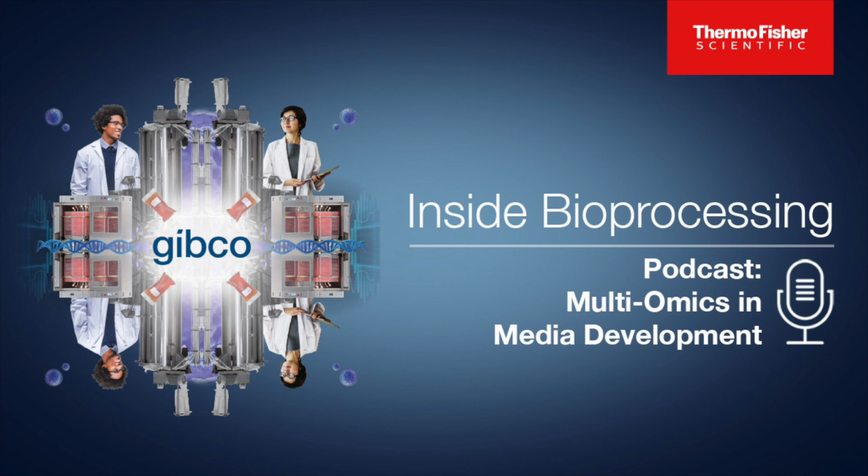What are different types of technology that can be leveraged when conducting this sort of multi-omics analysis? Yeah, so for genomics, epigenomics, or transcriptomics, right now scientists usually use next generation sequencing, right? Because the first generation sequencing is definitely Sanger sequencing. So right now it is next generation sequencing, like RNA-seq, which can cover all of those RNAs, long read, so it can give a comprehensive understanding of our transcriptomics.